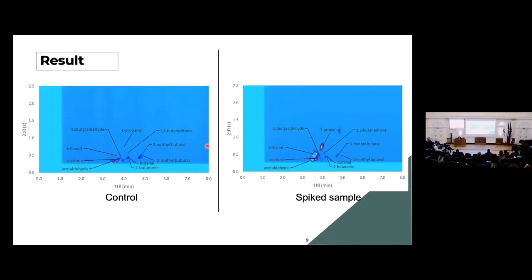I'd just like to explain why we went with 5 minutes for the GC run. Why not longer? That is because we did run a full series of close to 1 hour for the GC. But after that, we discovered that half of these features were located in the first 5 minutes of analysis. Because our overall aim was to develop a rapid technique, we were curious to see whether we could replicate something similar if we just looked at 5 minutes. So in the end of the day, we deliberately cut down the GC time to 5 minutes, and this is what we got. It's quite a huge success for us.